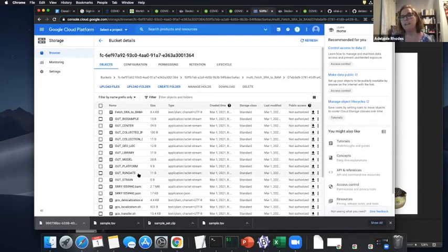So my idea is to make a Jupyter notebook that could harness the power of BigQuery. So this is no longer running inside the WDL. Anytime you can avoid having to run a huge workflow, like if I put in 10,000 SRR accession numbers, you can imagine that's 10,000 instances of orchestration that Cromwell has to do, and there's hog rates and all this other stuff. No. I could just go to the data table and download this information and combine it back, right? So that's another idea here.